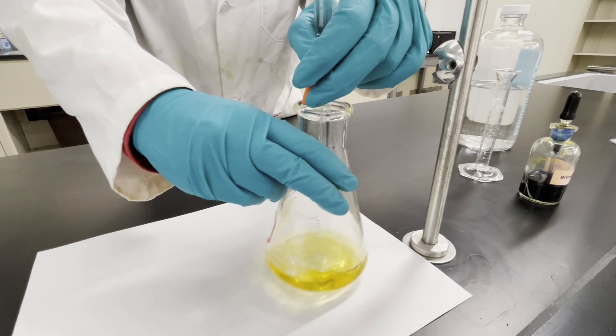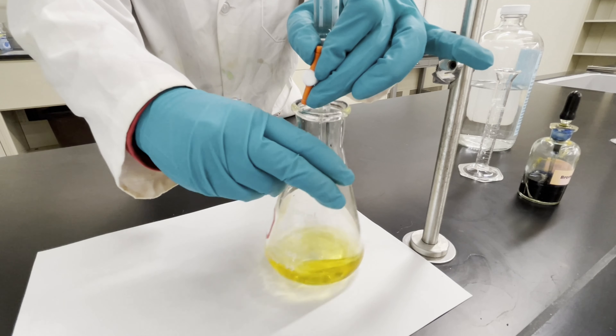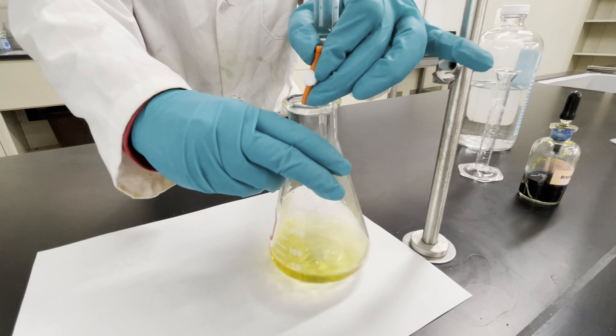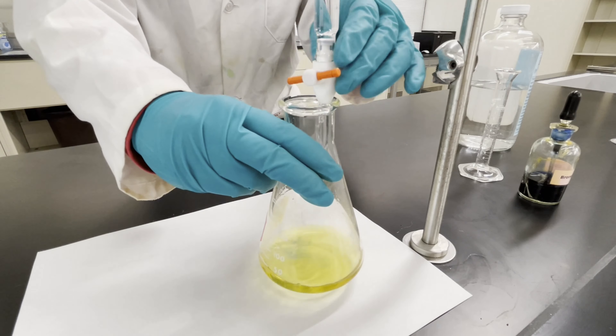Titration is a technique commonly used in labs to determine the concentration of unknown chemical substances. Titration is based on stoichiometry, which is a part of chemistry describing the amounts of chemicals needed for a reaction to take place. This is kind of like a recipe where different amounts of each ingredient are needed to make a dish.